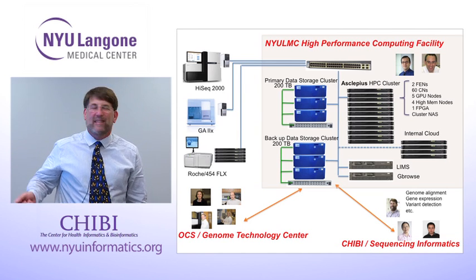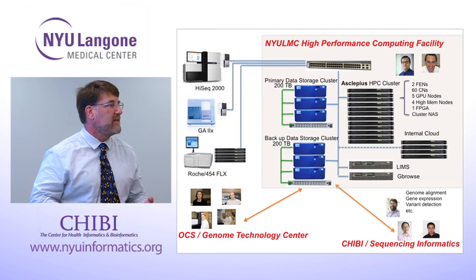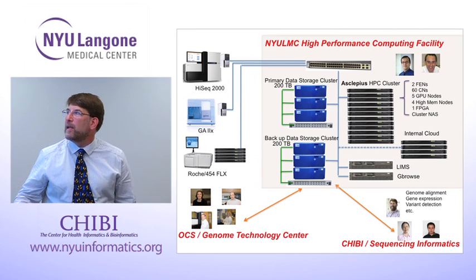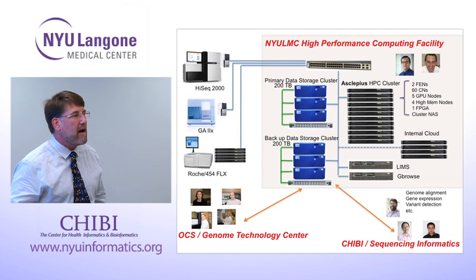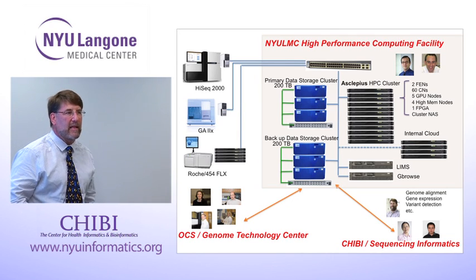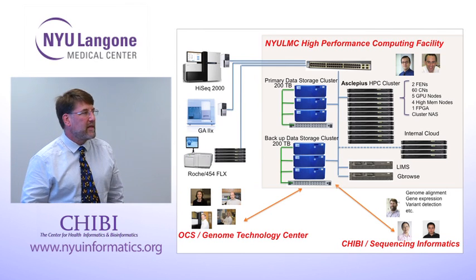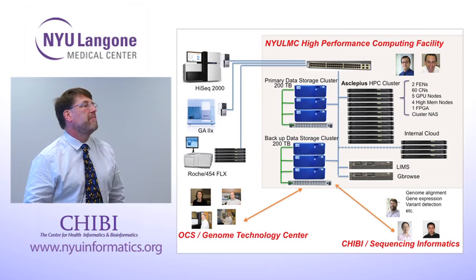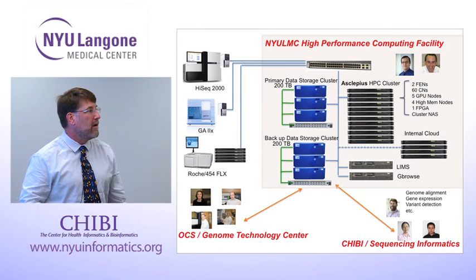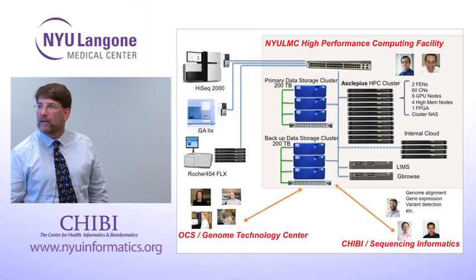And basically, this thing just has to scale as we add capacity to the sequencers. As they churn out more data per week, we need to add more CPU power to keep up with it. There isn't really an alternative. It's not like the algorithms are just going to magically get faster or the data is going to get smaller. And as we add more sequencers, we have to run this on more runs of data simultaneously. So again, scaling is important.